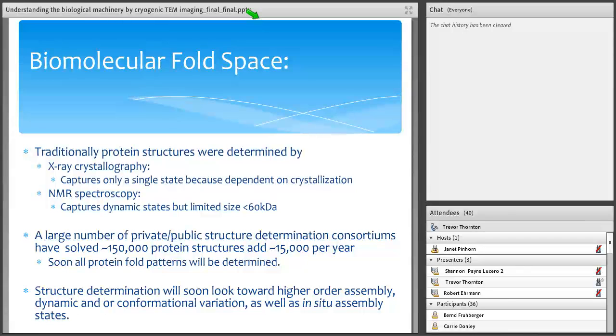And so it's believed that we'll soon solve the protein fold and DNA fold patterns, and really it'll be a computational problem more than it'll be a structural problem. This is amazing, Dwight. This sounds like in the past we haven't been able to image these proteins in their real state and see what they really look like, but now they're doing this 15,000 times a year. And so that's the big question right now.